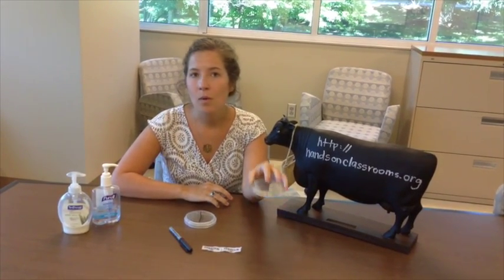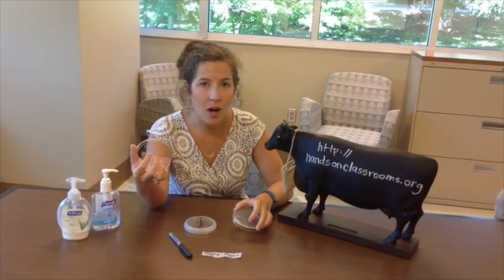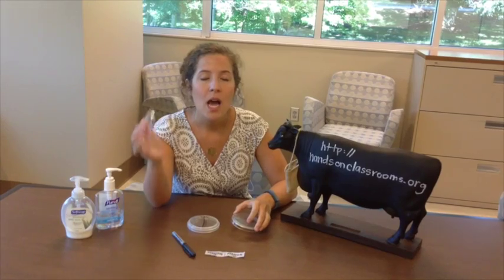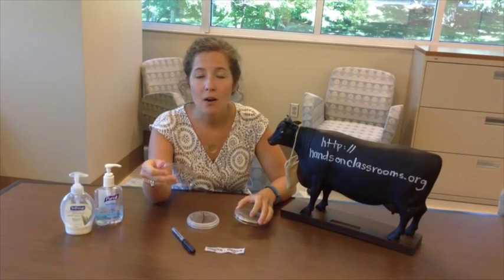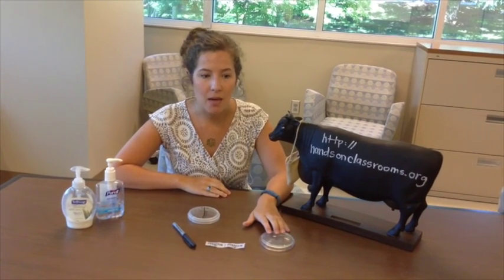The base also contains the agar, and this is what we will be writing on. Then you have a lid, which is stamped with the company of agar plates that we use, Rimmel. The lid needs to always remain down and always remain on the plate. We're going to always store it lid side down and base side up.